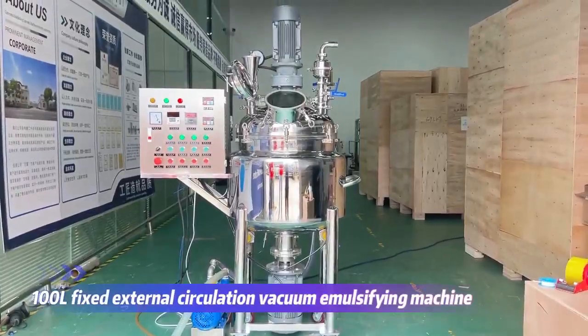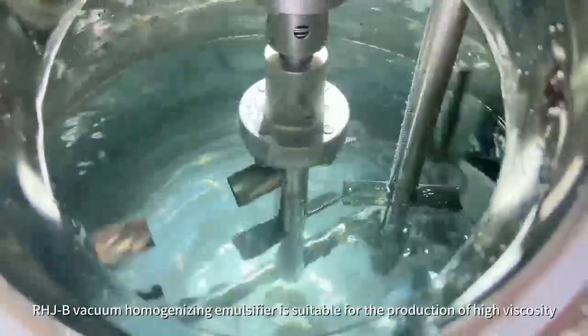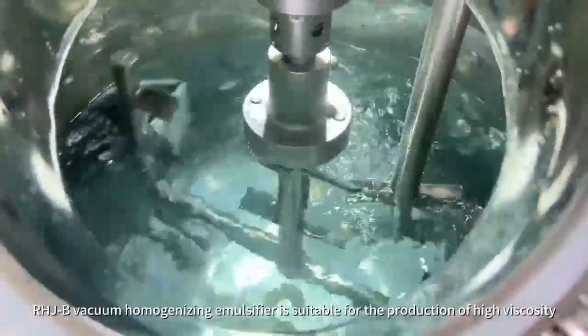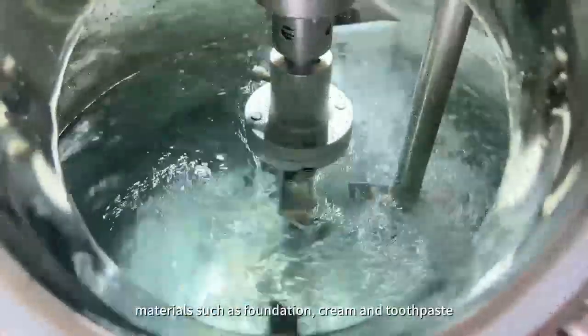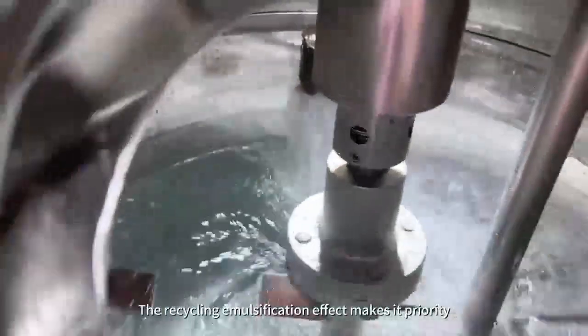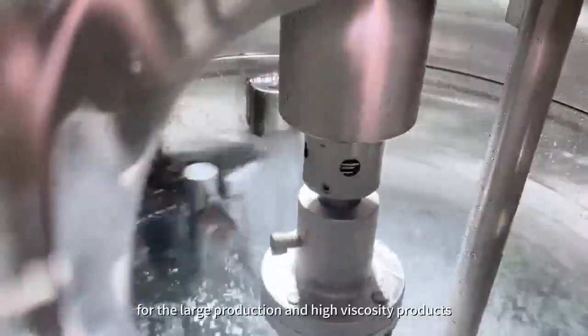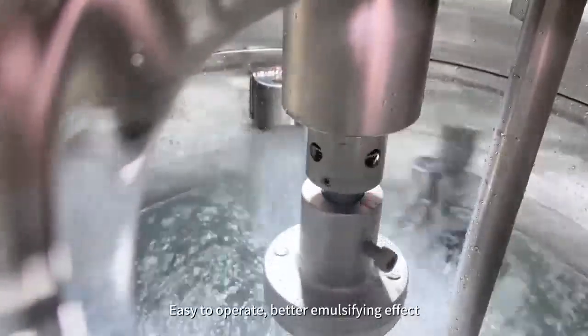100L Fixed External Circulation Vacuum Emulsifying Machine. Our HGB vacuum homogenizing emulsifier is suitable for the production of high viscosity materials such as foundation, cream, and toothpaste. The recycling emulsification effect makes it a priority for large production and high viscosity products. Easy to operate, better emulsifying effect.